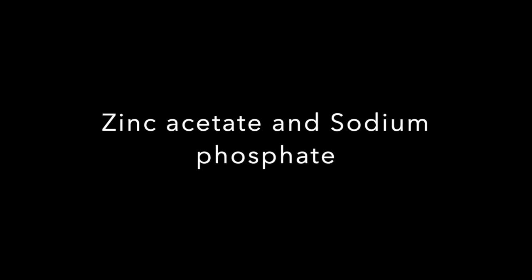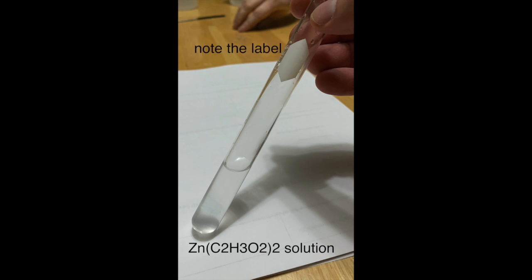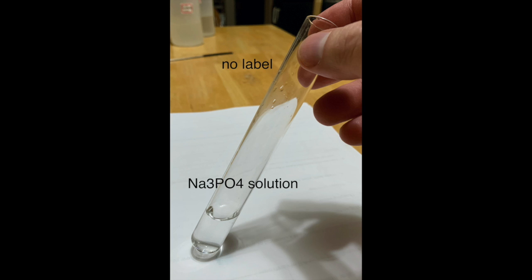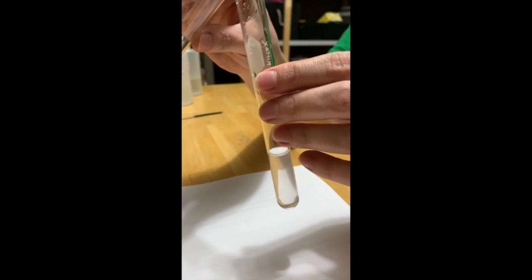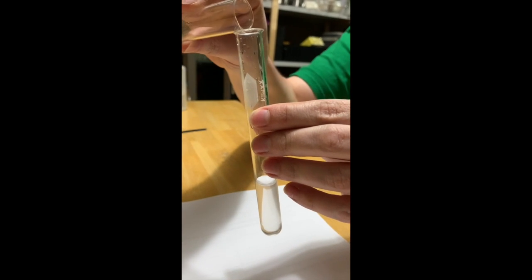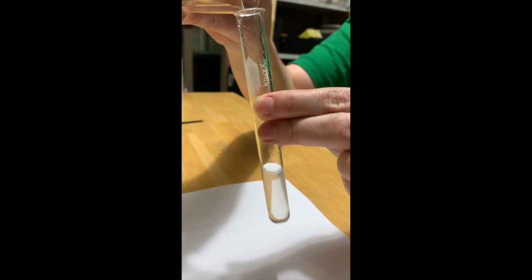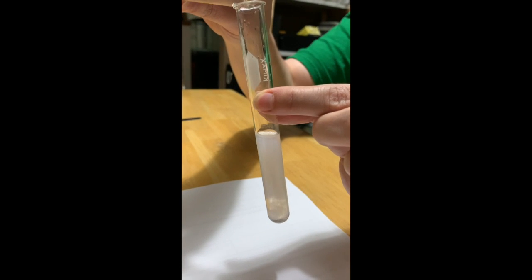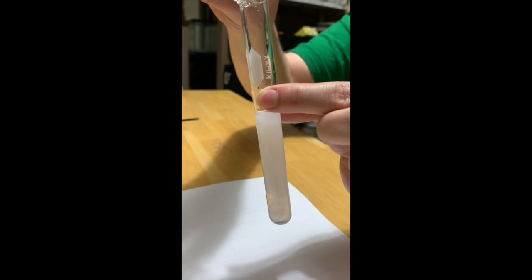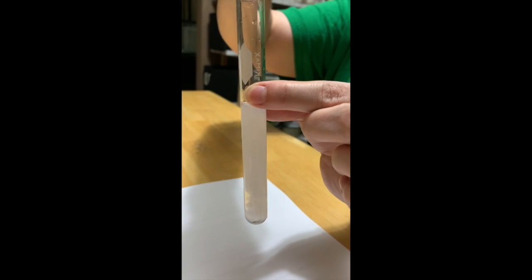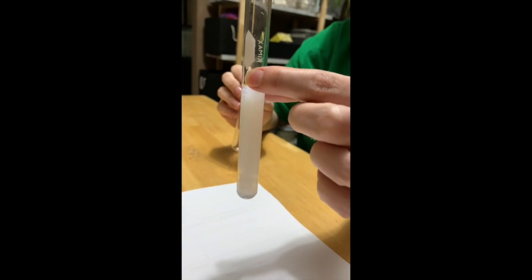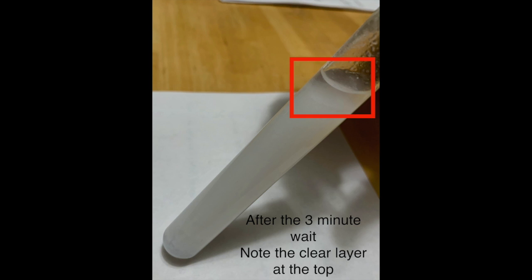Now the zinc acetate sodium phosphate double replacement reaction. So there's the zinc acetate solution. There is the sodium phosphate solution. Same thing. We're going to add those two solutions together and watch what happens. And then again, through the magic of movies, three minutes later, what that looks like.